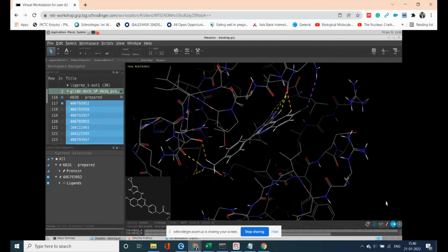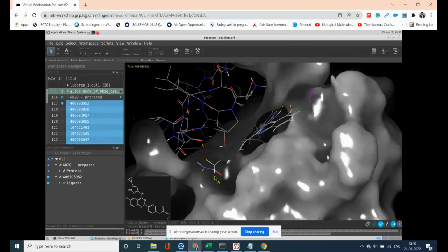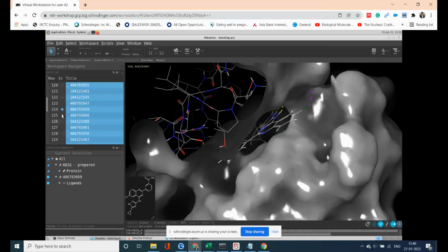I hope I can see the surface of the pocket and try to compare it with all the other ligands that are present, as in how the orientation and what is the coverage of the pocket it holds. So if you are curious to find a fragment that should specifically fit specific pockets of interest for specific biological cascade mechanisms, then you could select. For example, if I'm focusing on this pocket, it's just an example. Okay, don't take it too seriously. So if I need some fragments, then I would be curious and focus on the interactions also and the fragments that are cleanly shown in this part. So this is another way.